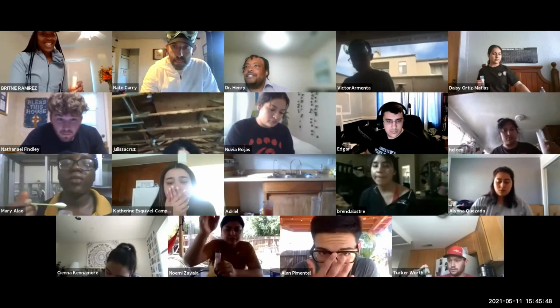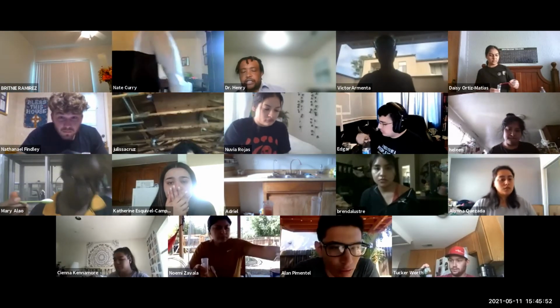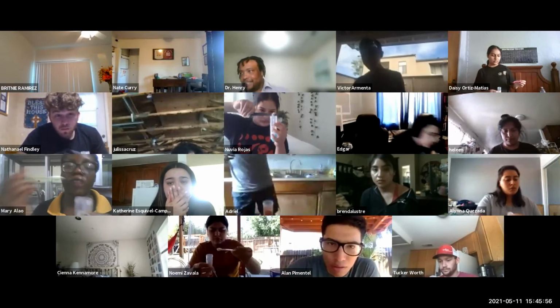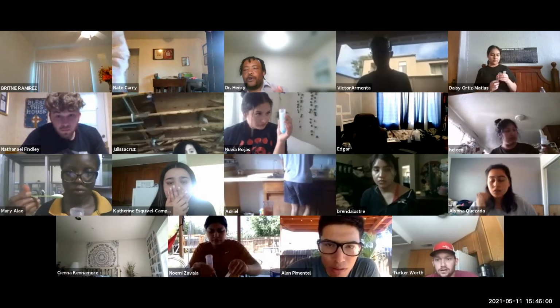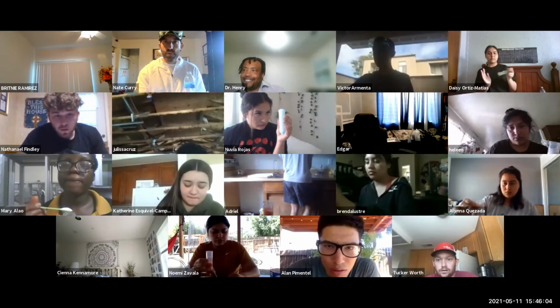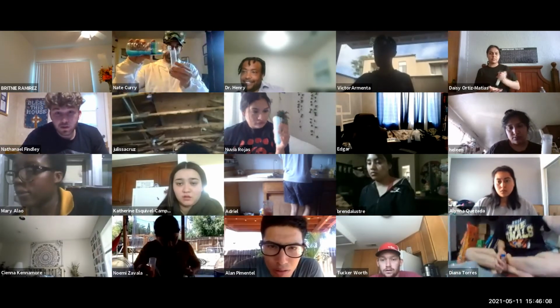Okay, so Dr. Henry, when do you use these strips? I'll tell you when you guys need to use the strips. For now we just keep doing this process over and over and keep recording the volume. Yeah, so you're gonna do it 3 to 4 times, Brittany. Okay. 3 to 4 times. All right, I'm going on time number 4 here. Wait, Dr. Henry, is it 3 to 4 times with the 5 milliliters or the 10?